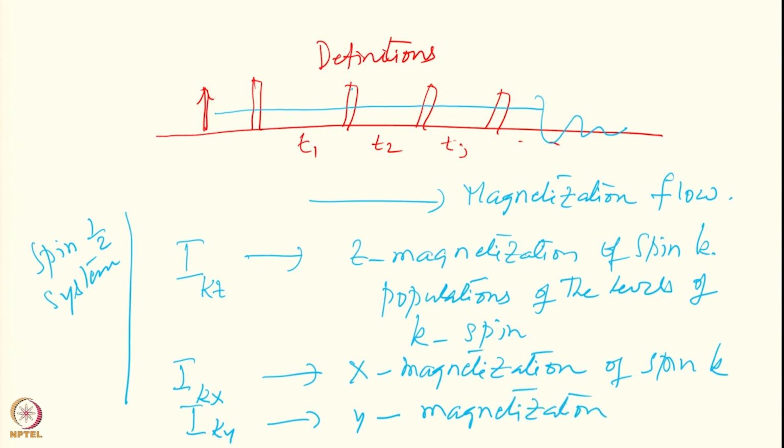Now, among these, what is it that we observe? It is the transverse magnetization, right. We always measure transverse magnetization.